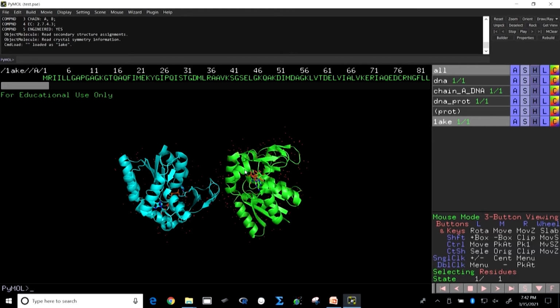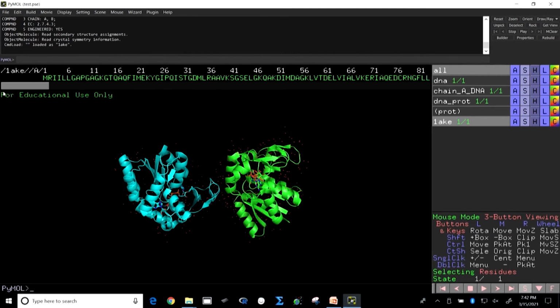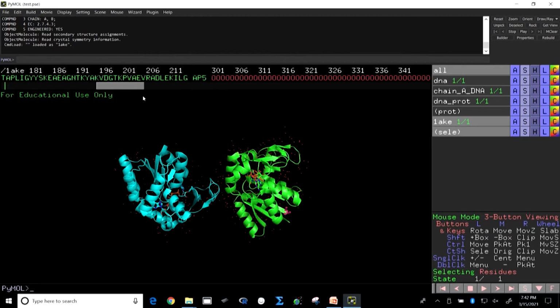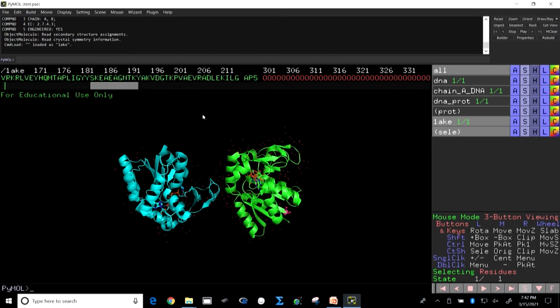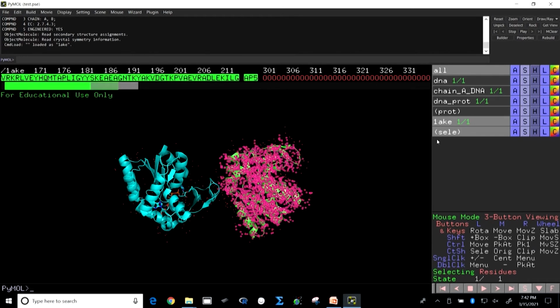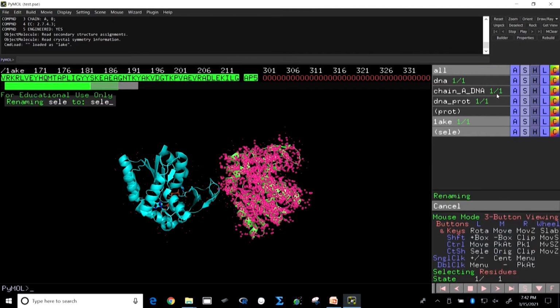So, when you color differently, you get sky blue color for one chain and green color for the other chain. Now, if you need the monomer, you could save it. If you want to save the waters, you could save the complete. If not, then you could save up to this. So, you get a file and you rename it, this is 1AKE. So, you make 1AKE_mon.